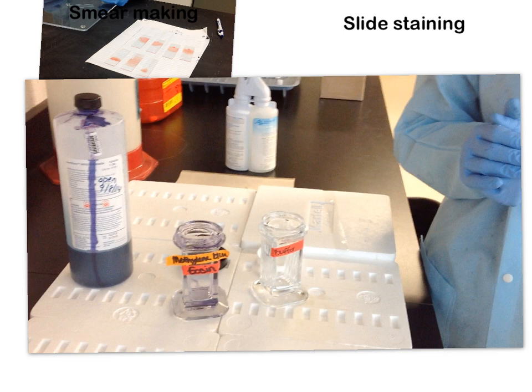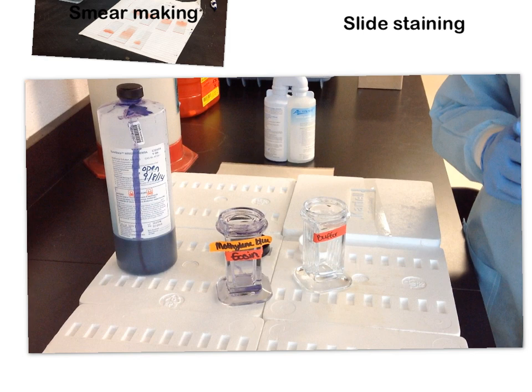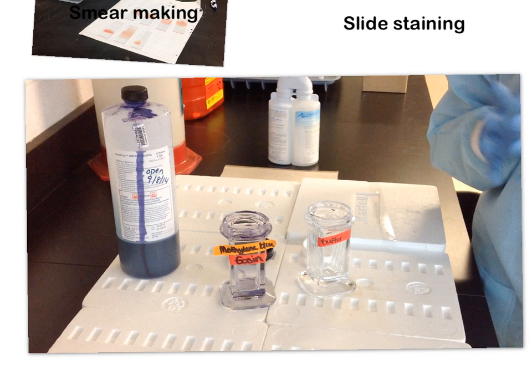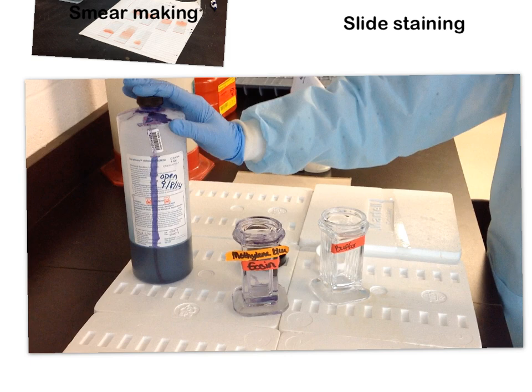Now that we've made our smears, it's time to stain them so we can examine peripheral blood morphology and determine if there are normal or abnormal findings on our patient smear. We are going to use something called Wright stain, which consists of two components: the first is methylene blue, and the second is eosin.